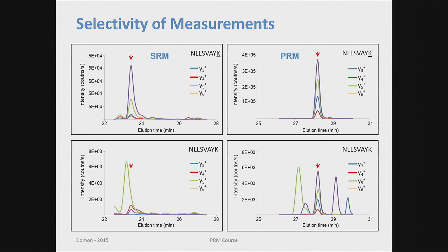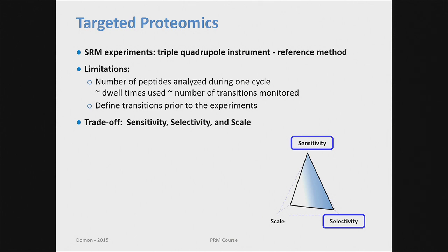Right? So interferences in a low resolution mass analyzer are not uncommon, especially if your samples are fairly complex. And this is back to the slide I've discussed before, right? So if we try to quantify, we now try to optimize these parameters, and we have made a trade-off. We didn't really try to get as many peptides as we want in the experiment.